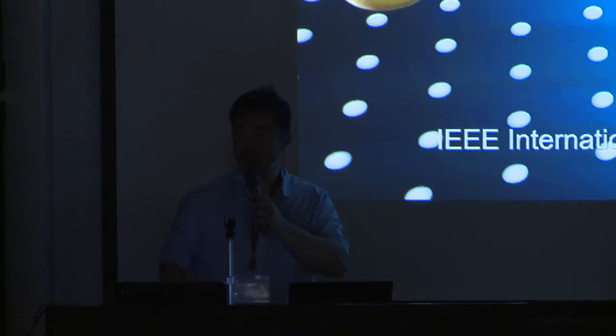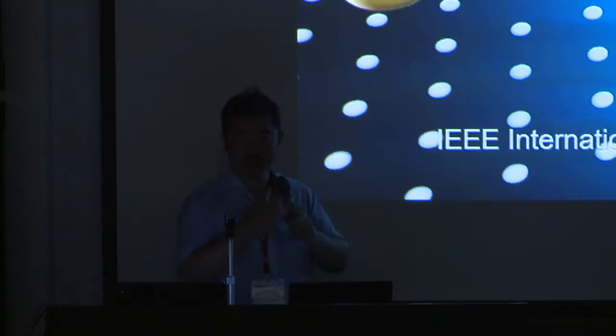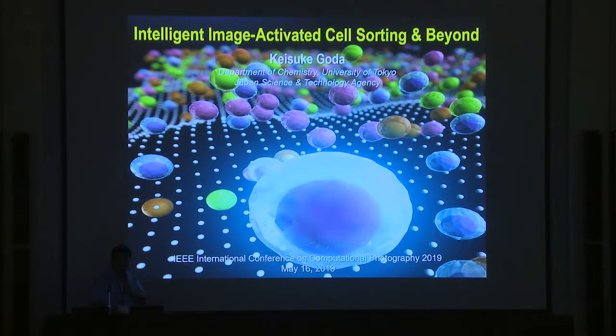Oh, good. Well, thank you very much for the introduction and also the invitation. So I'm from here, University of Tokyo, but the other campus. So I will talk about a kind of new type of technology called intelligent image activated cell sorting.